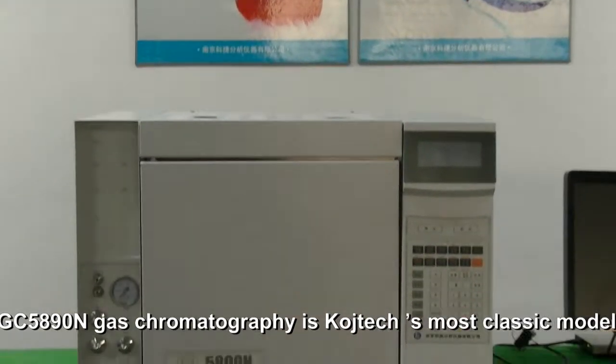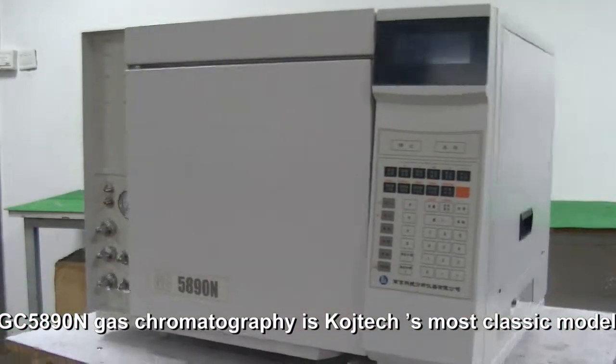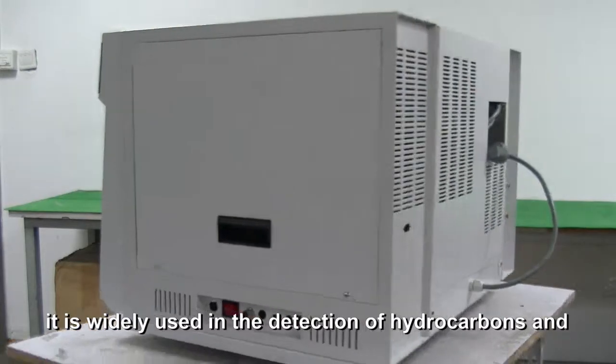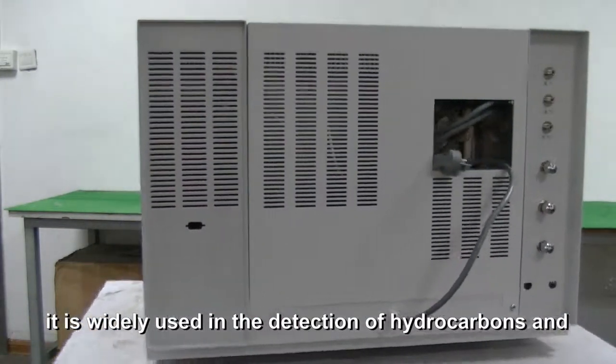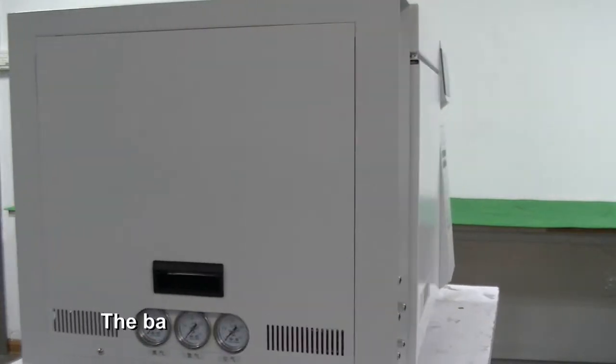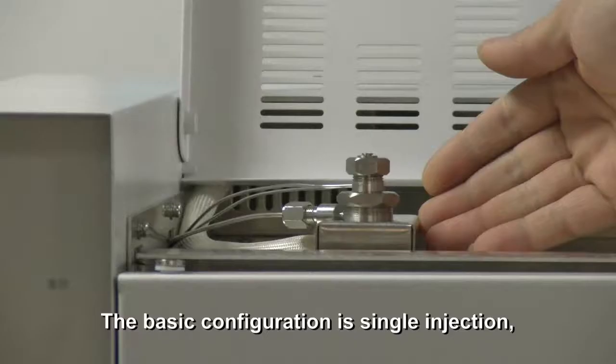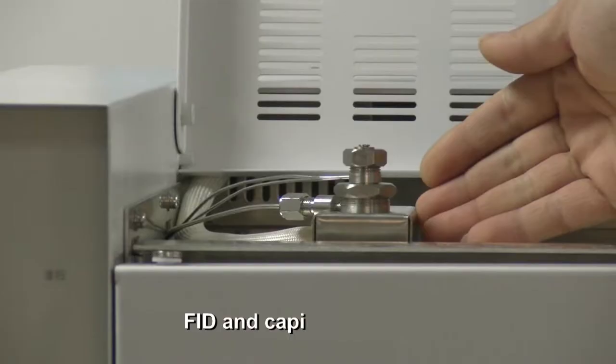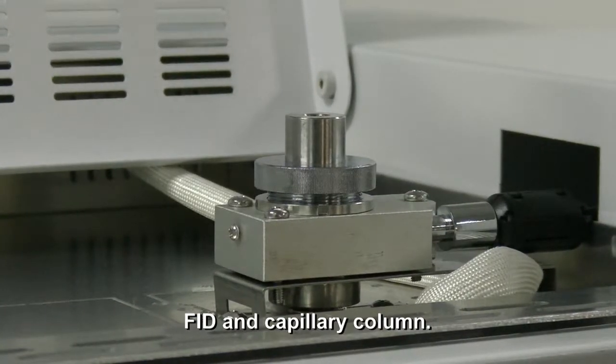GC5890N gas chromatography is Cordiotec's most classic model. It is widely used in the detection of hydrocarbons and some carbon-contained compounds. The basic configuration is single injection, FID, and capillary column.